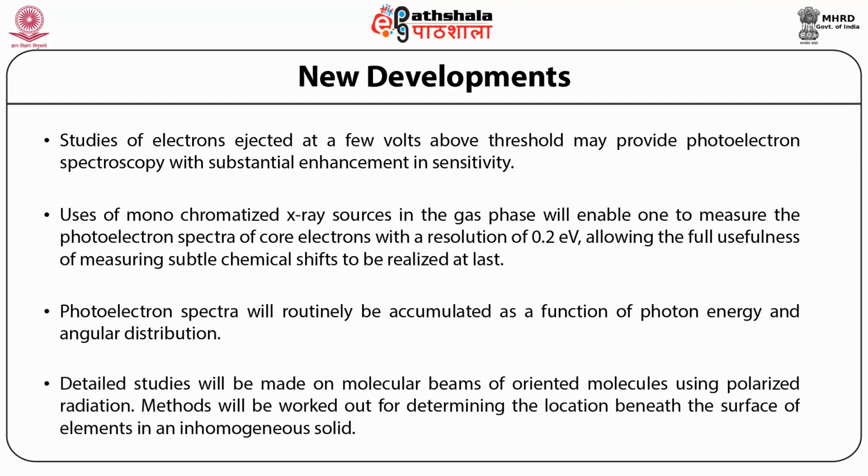Methods will be worked out for determining the location beneath the surface of elements in an inhomogeneous solid. So these are the conditions which one has to keep in mind while working out the exact positions of these peaks that shall arise in photoelectron spectroscopy.